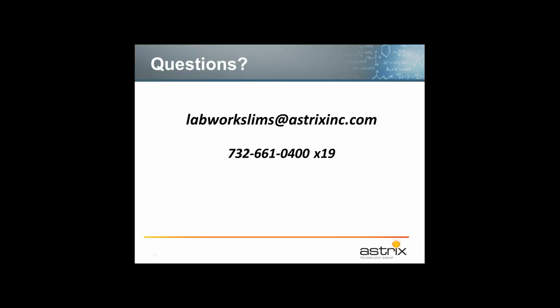Yeah, within Crystal itself, there are the help functions, but depending on what version of LabWorks you had, within the installation files, there was a Crystal report manual that was placed in some of those files. That had some tutorials on how to make some of this stuff happen. Look in your installation folder, on your LWEXE folder on the server, to see if those PDF documents, like your installation manual and Crystal report manual, are there. If you do not have any of those, send us an email to that address, and I'll be happy to send you a PDF copy of a Crystal report training manual.